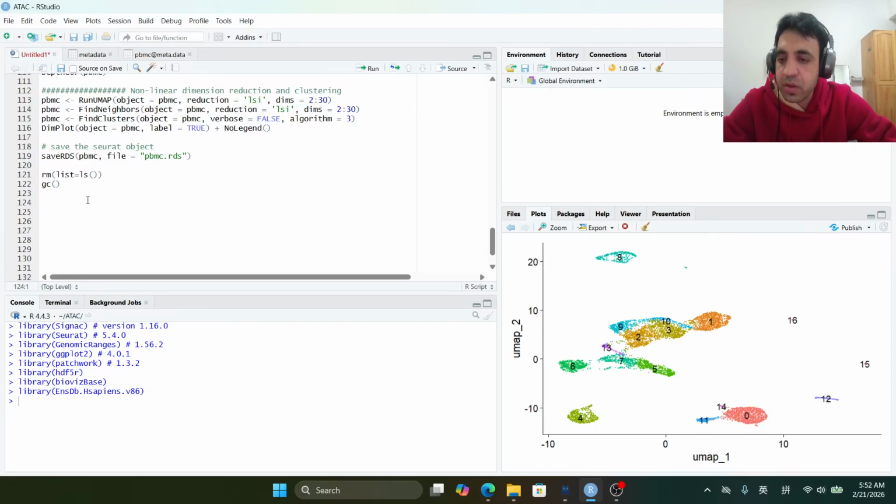After performing all the pre-processing steps, filtration, clustering and quality control, now we will label the clusters. But the question is, how will we label the clusters, and is the process the same as that of single cell RNA-seq data analysis? The answer is no.